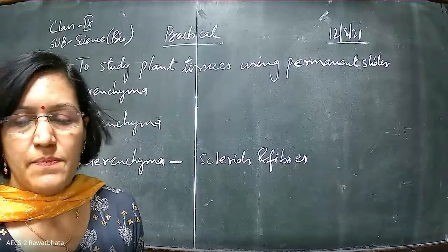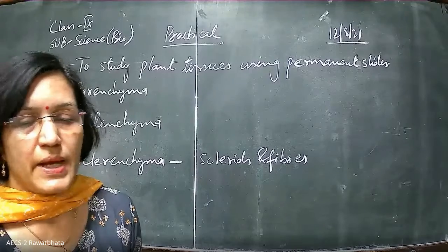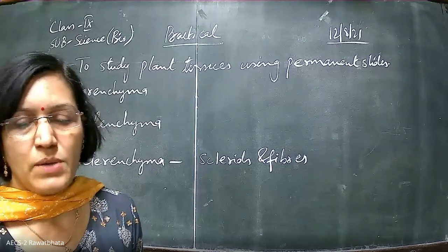And now let's see. Now we are going to understand parenchyma and collenchyma. I am sharing one more slide with you.